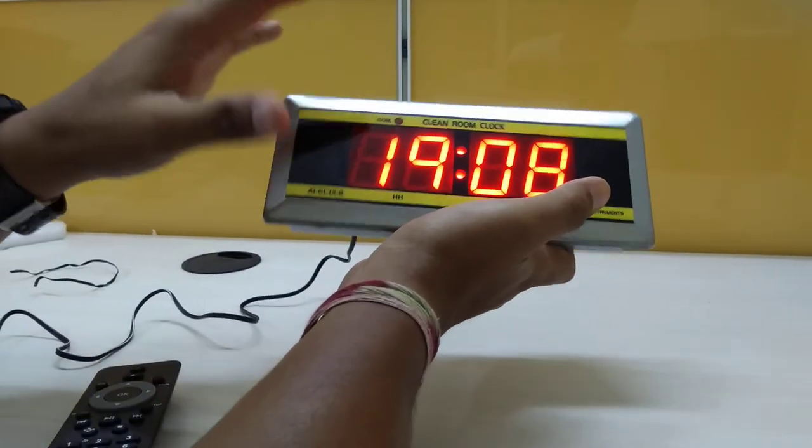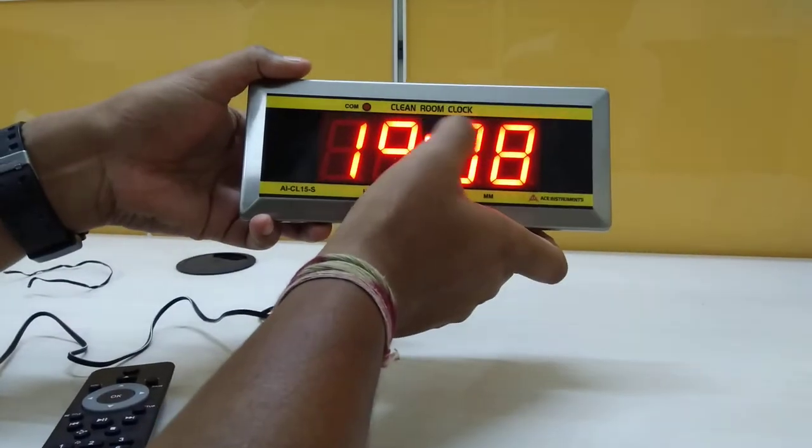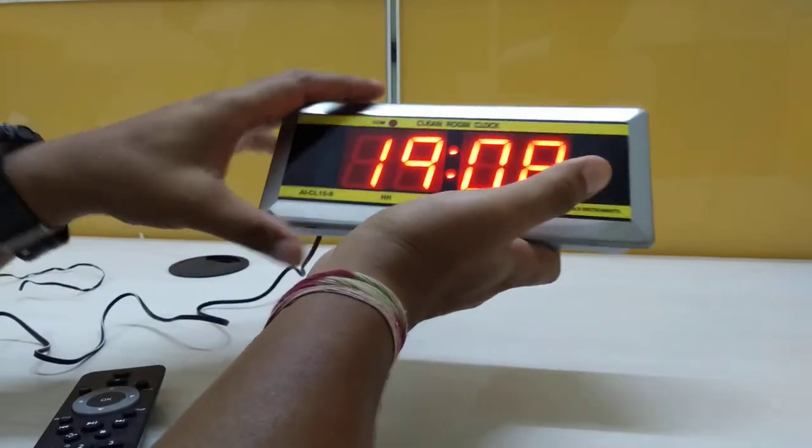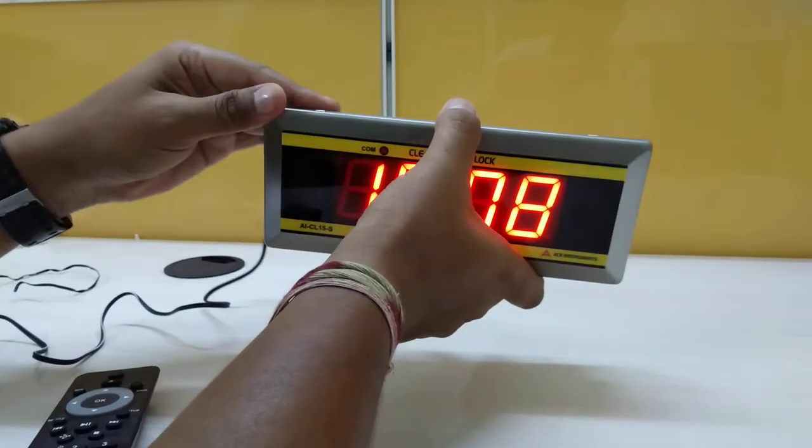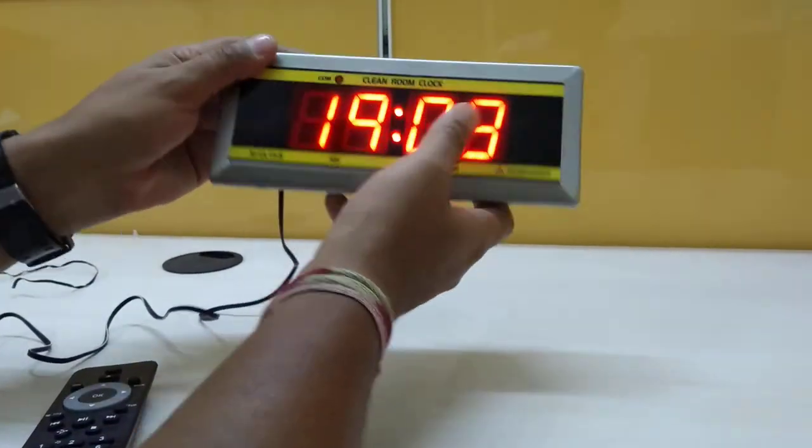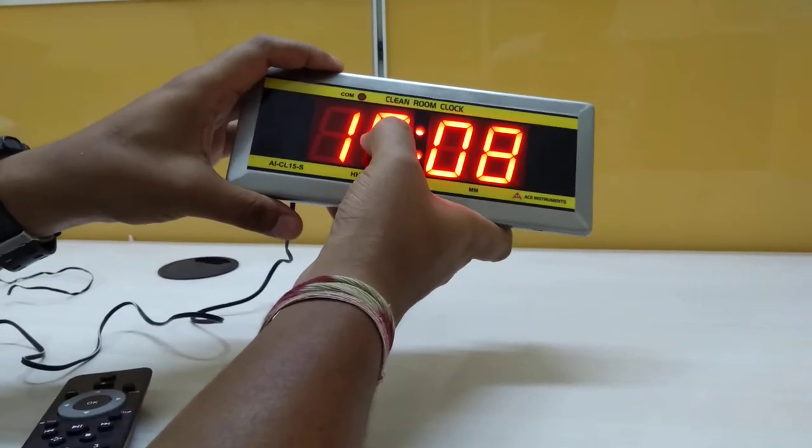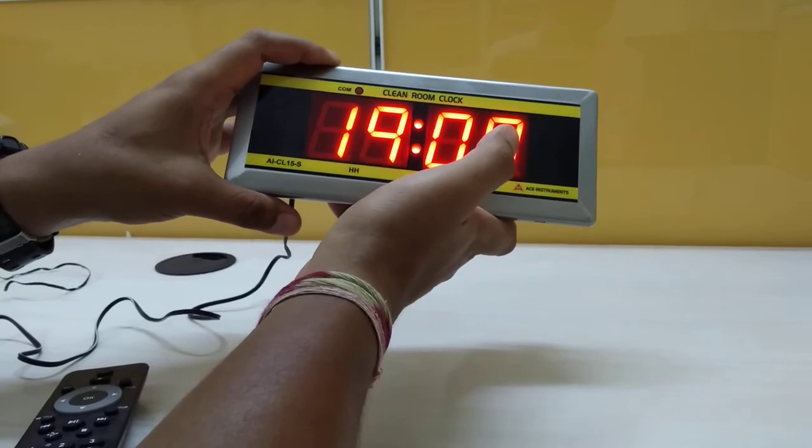That's the reason we have mentioned it as a clean room clock. If you see the body, this is basically an aluminum back and SS front plate. It has got a display of hours and minutes.